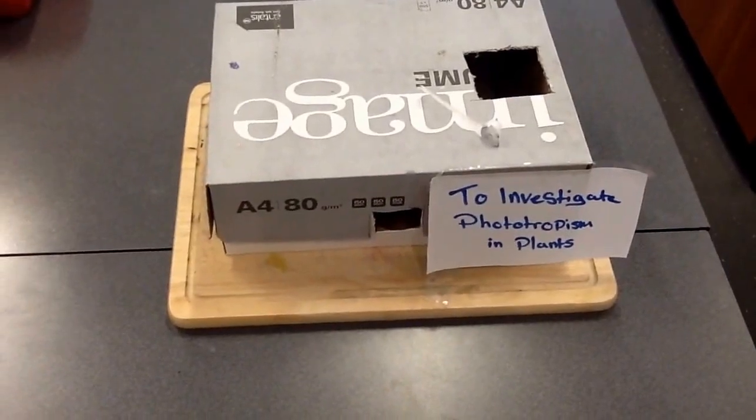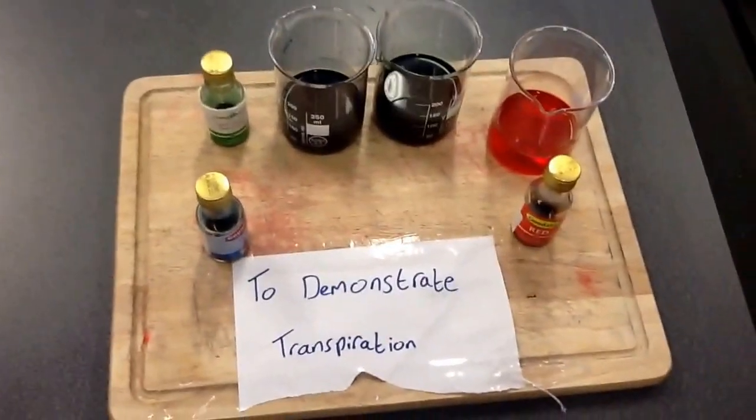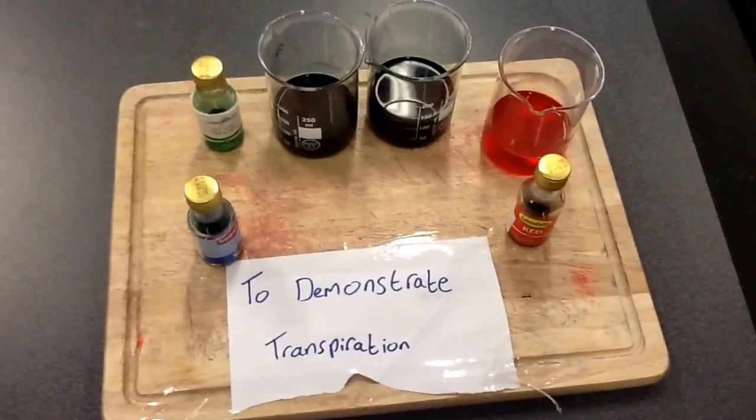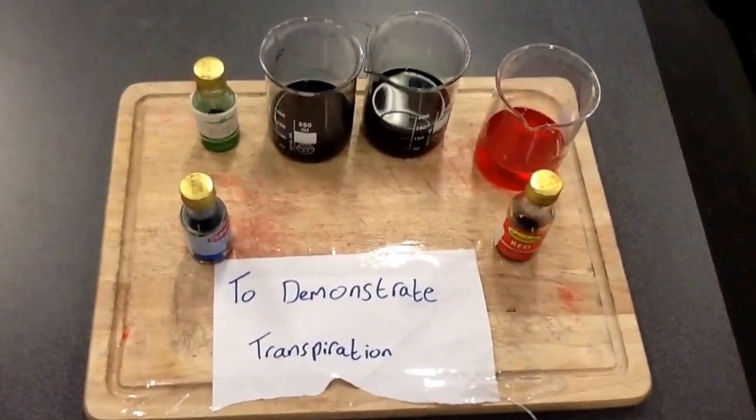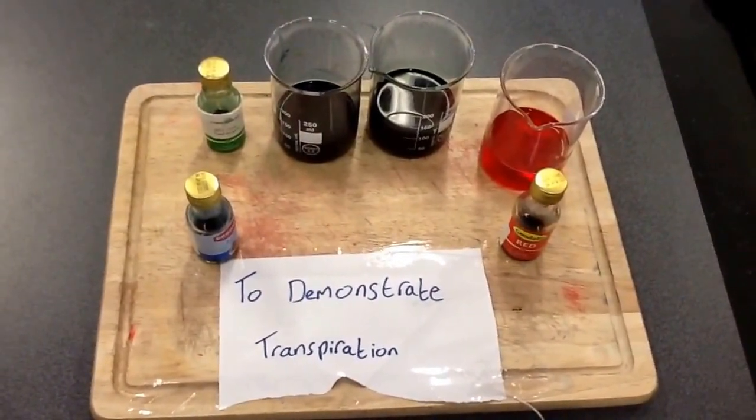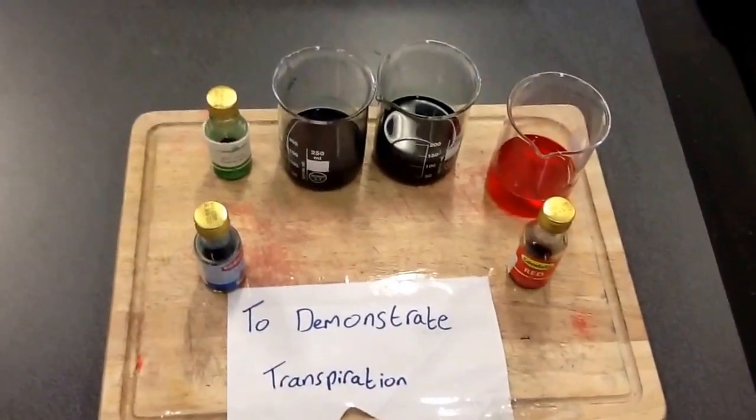The next experiment is to demonstrate transpiration. We got water in three beakers with three different colored dyes. We got three celery sticks and put them into the water. We noticed that, due to transpiration, the dye was carried up through the celery.